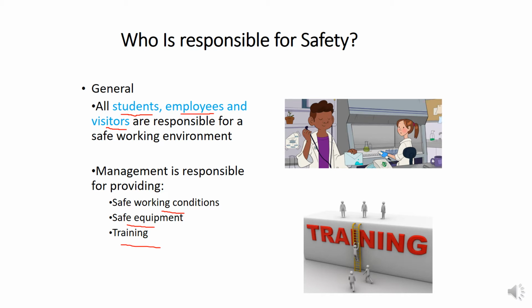Whenever we need training, there are certain training workshops, especially for the College of Medicine or the College of Nursing, and for people working in sensitive labs, for example in hospitals. There are certain lab safety workshops arranged by the RMO, the Risk Management Office. You can see the RMO at different stops, like a bus stop, where they mention some slogans about safety.